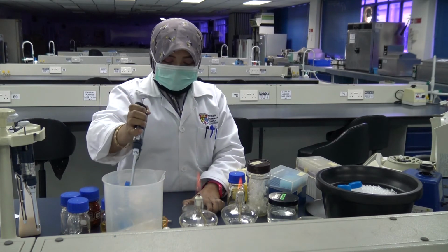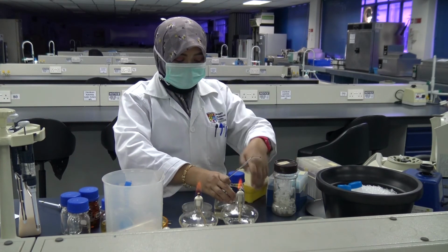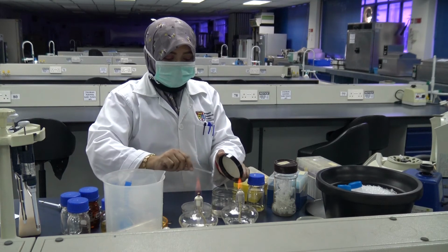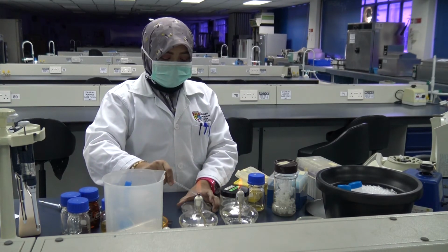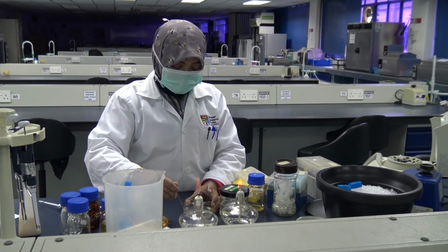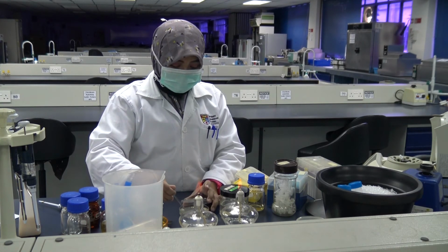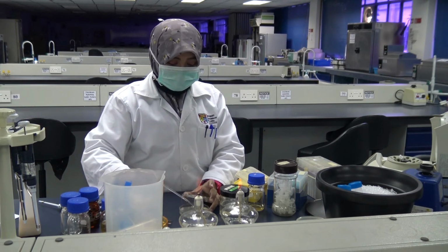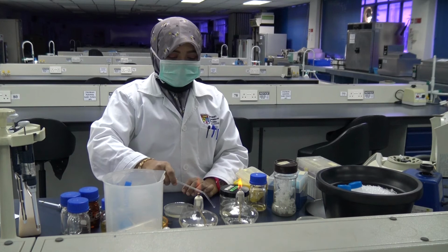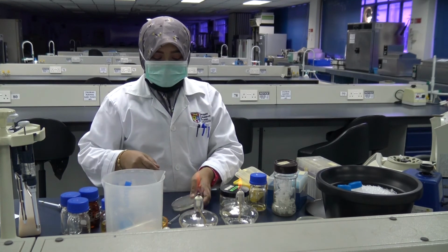So next day, when you come in to count the colonies that grow on here, this means that any colony that grows on ampicillin plates would show that they have undergone spontaneous mutation. So cells that grow on nutrient agar ampicillin plates will indicate that they have undergone spontaneous mutation. Remember, we have not induced, we have not used any mutagens to treat the cells, so any cells that can grow the next day on ampicillin indicate that they are resistant to ampicillin, and this is the result of spontaneous mutation.